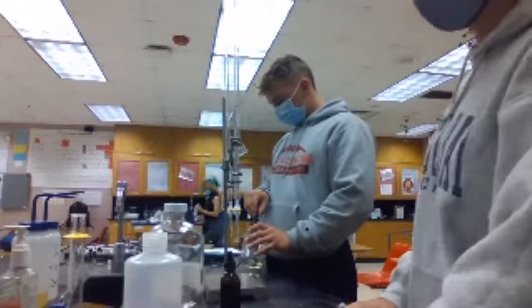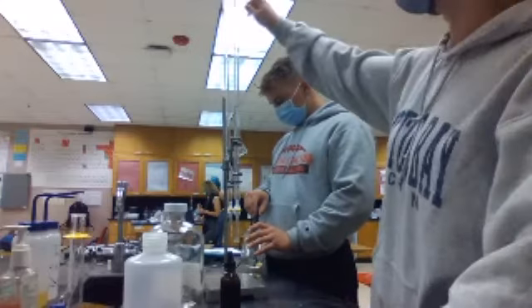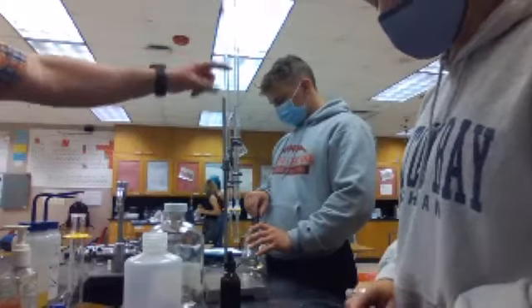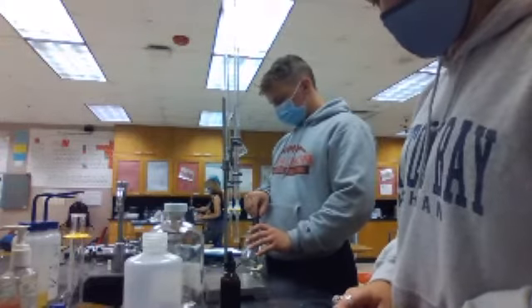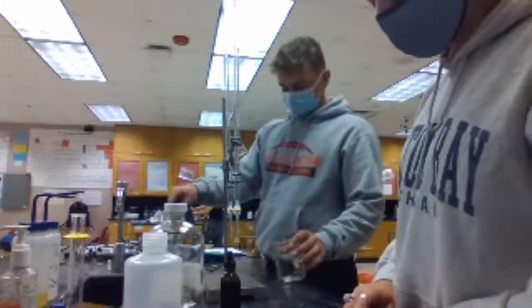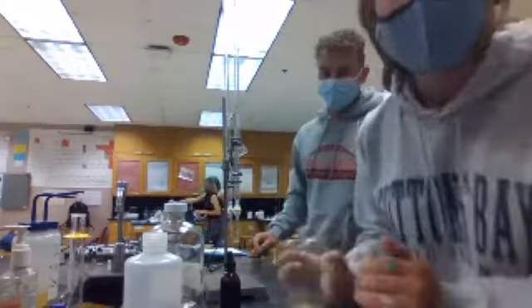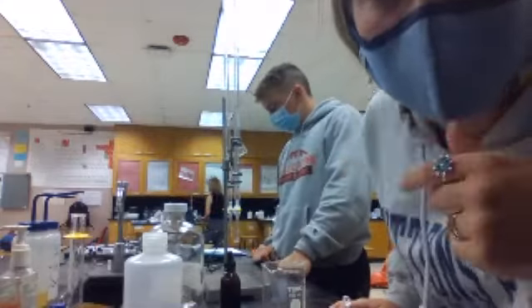What I'm confused about is 8.47 is all the way up here. Do I do the difference? Yeah, it's the difference. So 28, so it should be like 36 something, right? Oh, you add it plus 8.47? Yeah, because it goes down, right? Yeah. 1.18 is 3 milliliters, like on the graph.